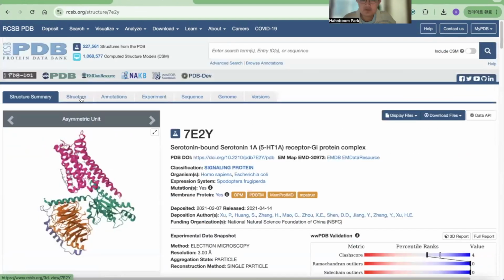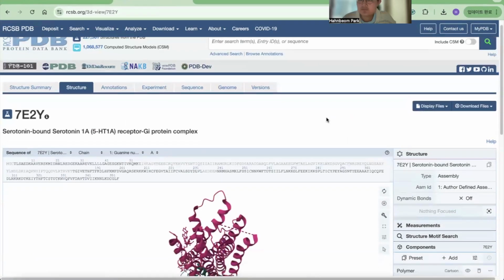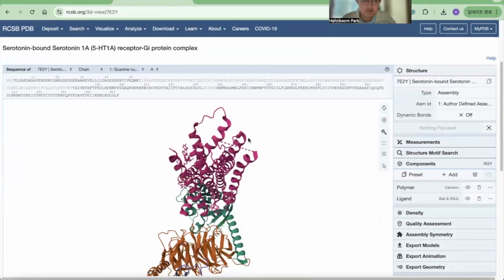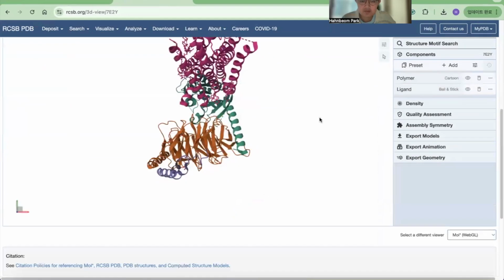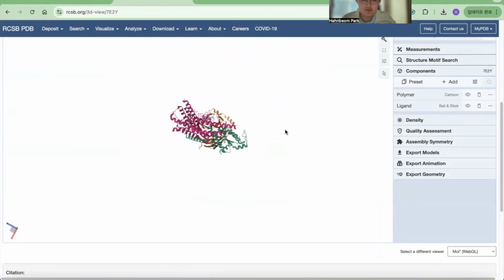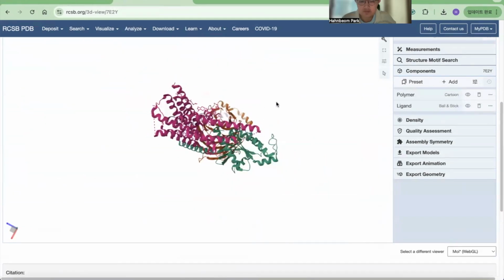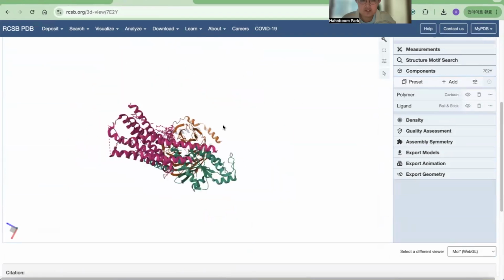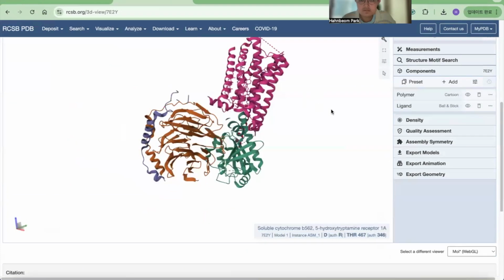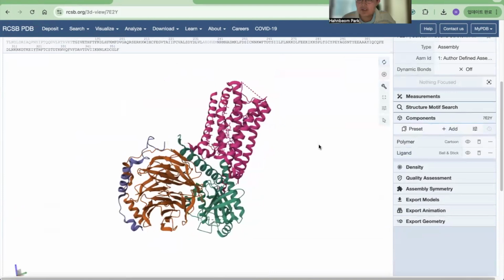By clicking individual tabs, you can get more information. This is a web version 3D molecular viewer. It's not perfect, but you can do quite a good job with this. You hold this 3D structure and rotate it like this. By using the wheel, you can zoom in and back out. By using right click, you can move around, and by using left click, you can rotate. If you move too much, you can click this button to come back to the beginning.